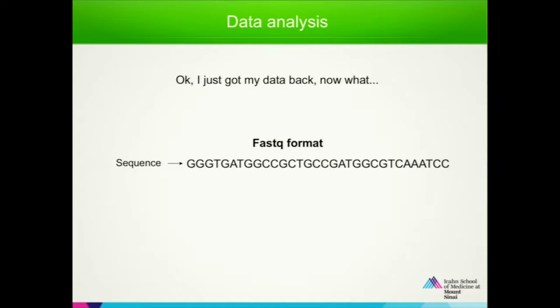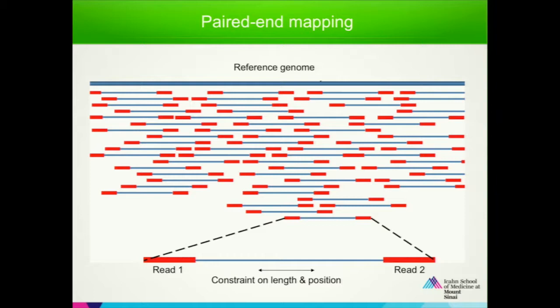And then when we do that, you take the reference genome and align all these bases. When you come to the bioinformatics side, you must have learned it yesterday, and you will be learning it in the afternoon and tomorrow. So this is what you'll be doing. Conceptually, why do we need to do all those things on computers using HPC? Because this is not an easy task. It requires a very high-end computing system. That's why it requires a supercomputing system. All the time, routinely, we have to do this.